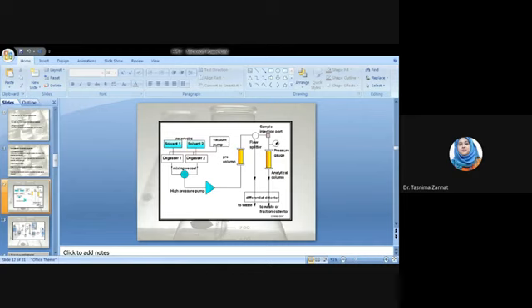Now I want to discuss one by one. This is also the example. It means the three-dimensional, sorry, the pictorial representation of the HPLC instrumentation. First of all, the solvent delivery system means the solvent reservoir. Solvent delivery system of the mobile, it is the mobile phase here. The mobile phase in HPLC refers to the solvent being continuously applied to the column or stationary phase.